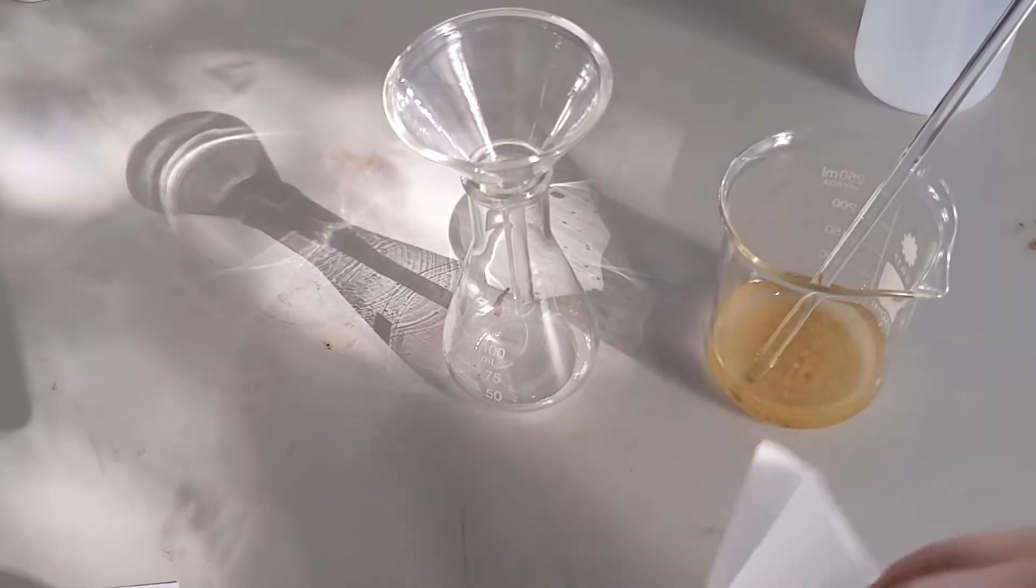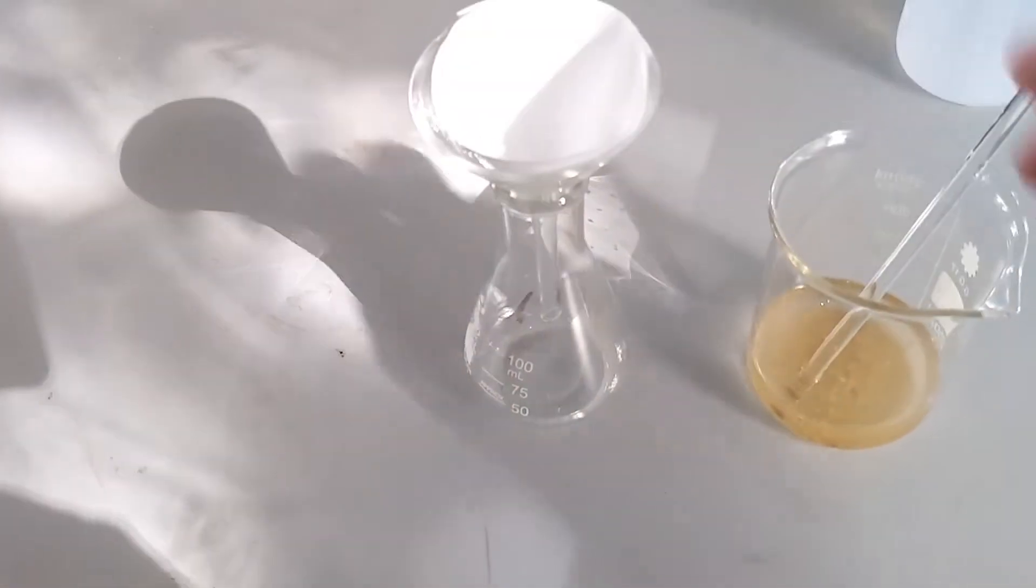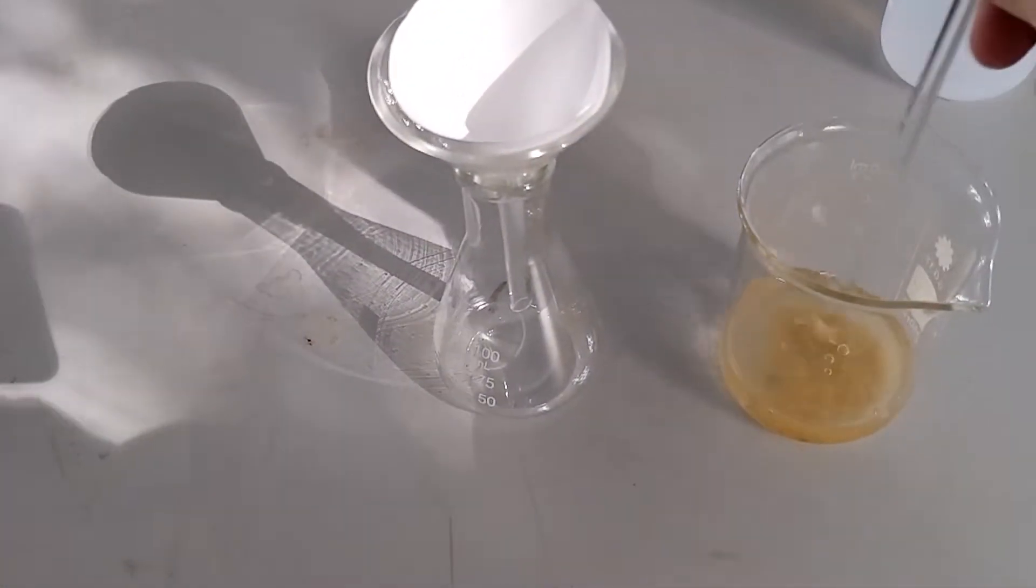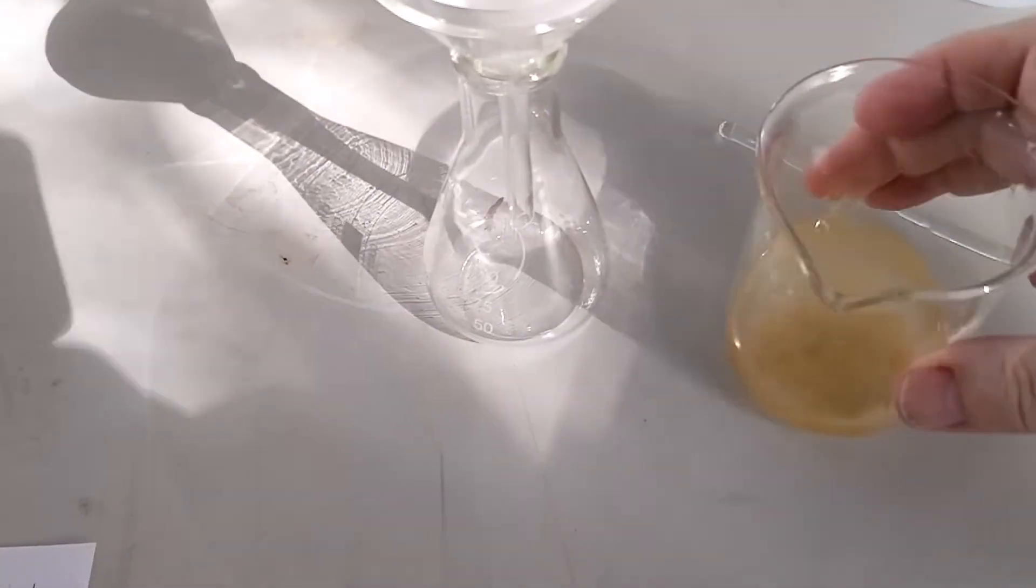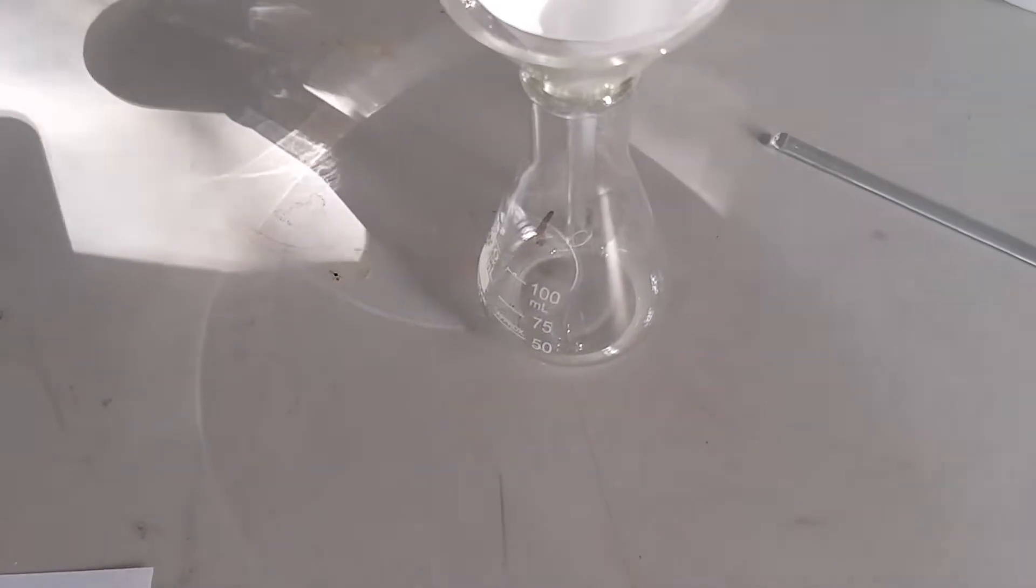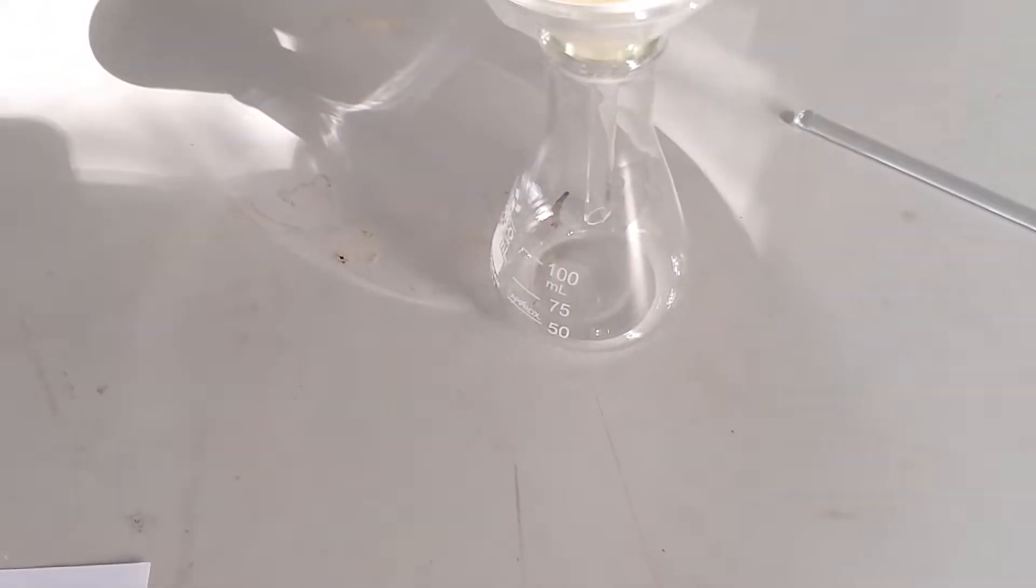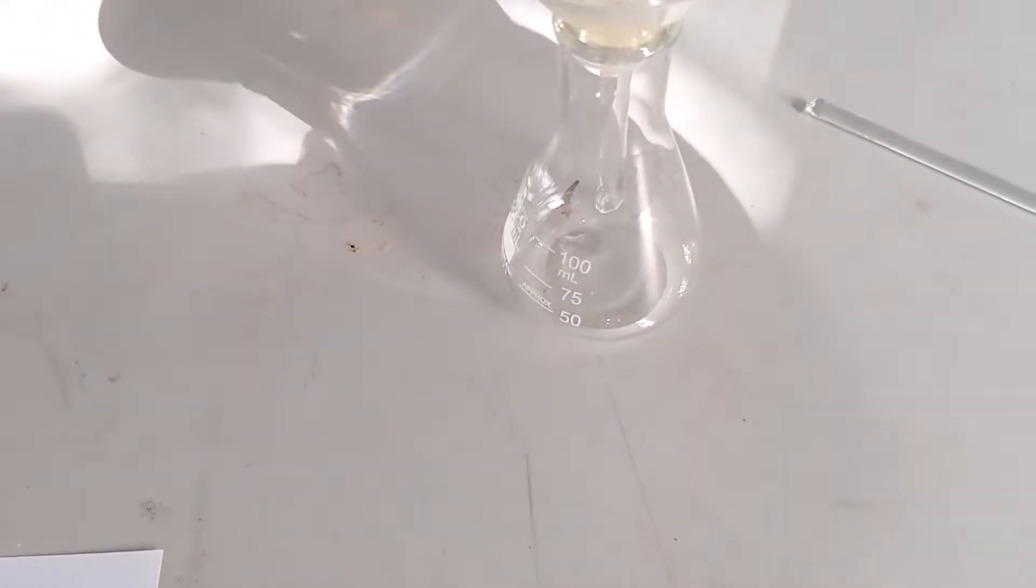Place the funnel in a conical flask. In goes the filter paper. Remove the glass rod and pour the mixture into the top, into the filter paper.